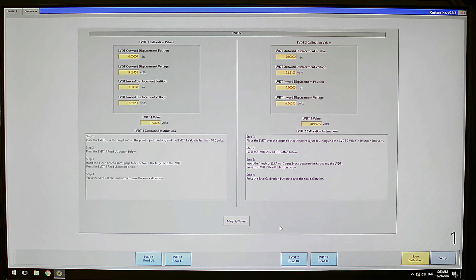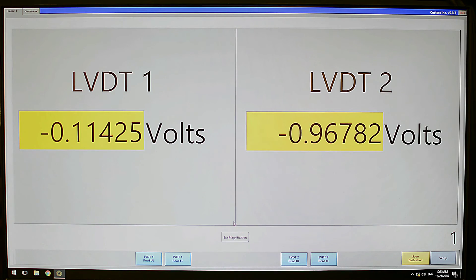To aid visually, you can magnify the live values by clicking magnify values. To return, click exit magnification.